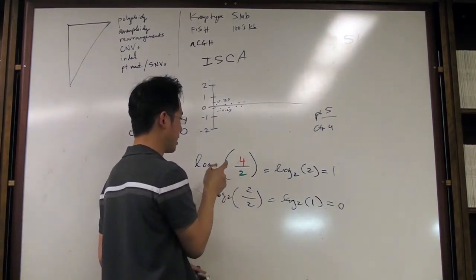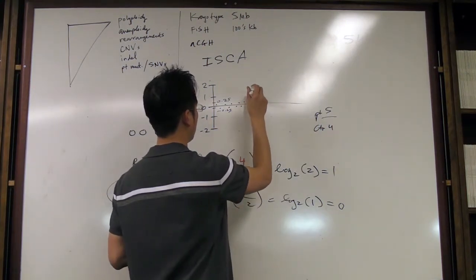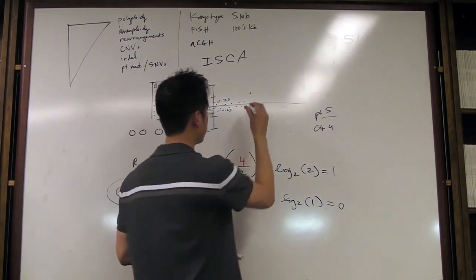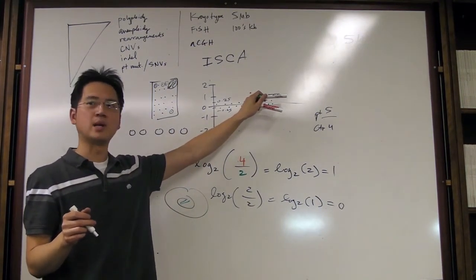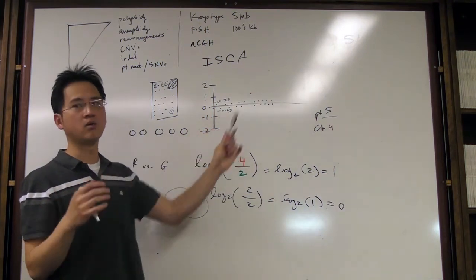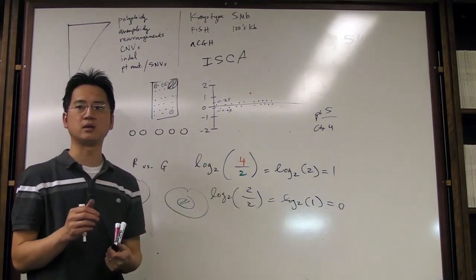Let's say you run into the situation where now you really have a legit copy number gain for this one probe. So this one is showing more red, so I'm going to now draw a dot around the 1 level. So now you have 1 dot that's legitimately gained in the patient relative to the control. Now let's just say the next one is back down to normal. So typically when I see this, it may be real, but I'm not going to trust it because it's only 1 data point out of 180,000 or so that's saying that there is a copy gain here. But I'm not going to believe just 1 data point. So I'm going to let that go as noise, even though it could be legit and real. The assay, the way it's designed, will allow you to detect that, but it's something you should not believe analytically.